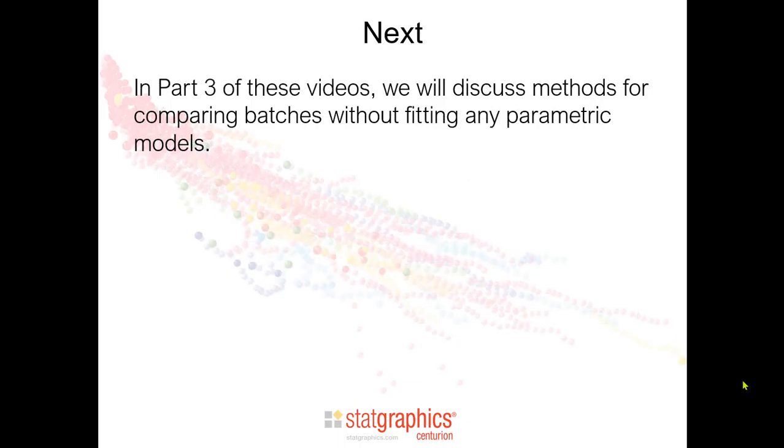In part 3 of these videos, we will discuss methods for comparing batches without fitting any parametric models.